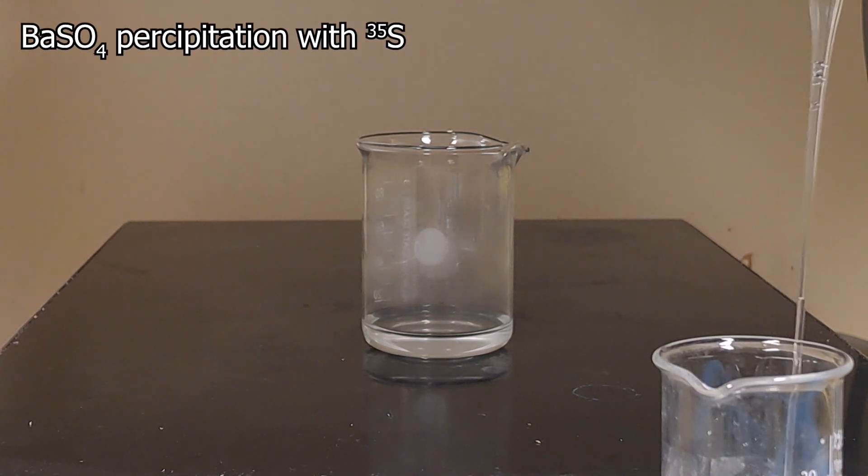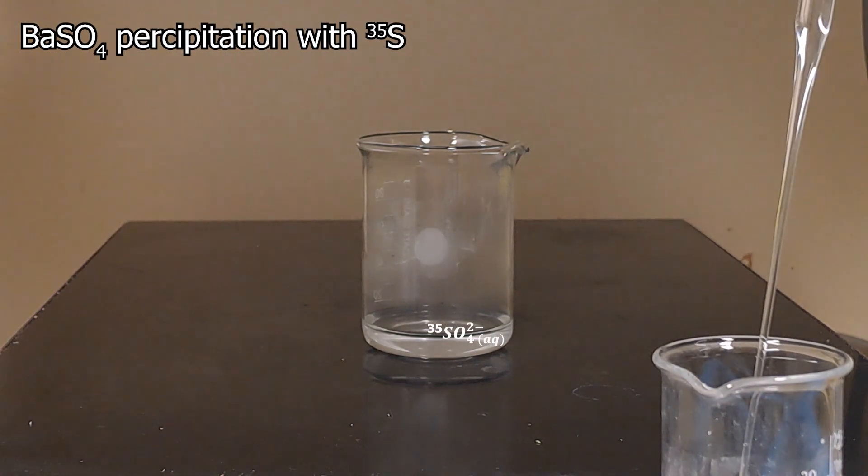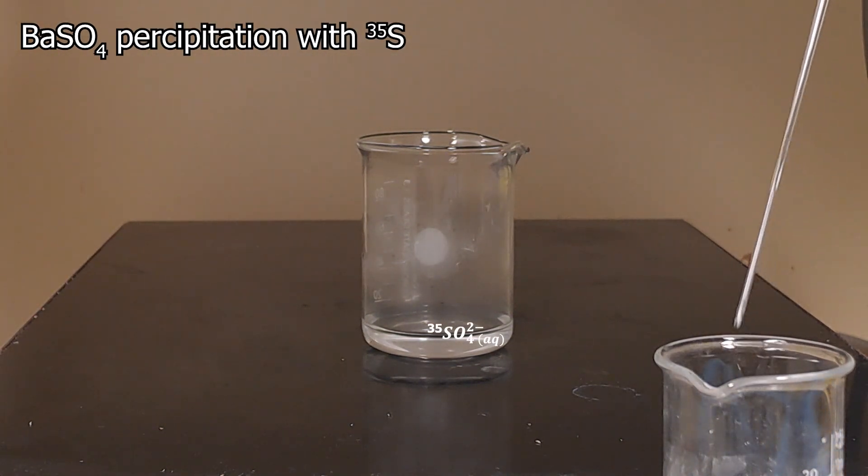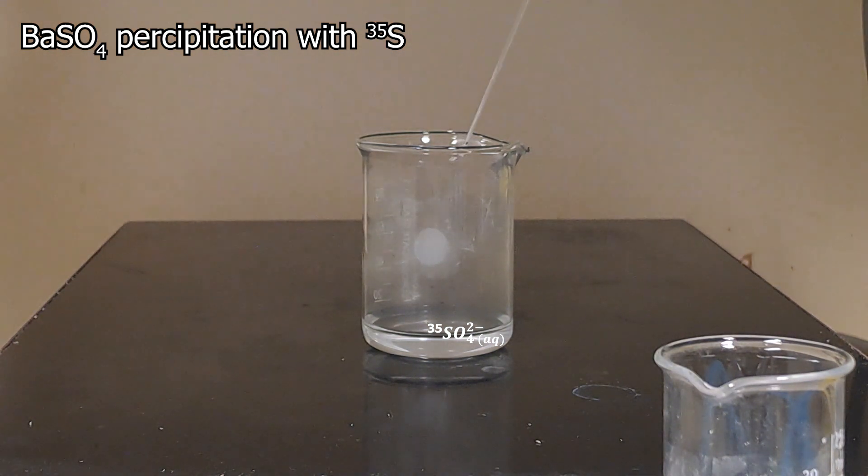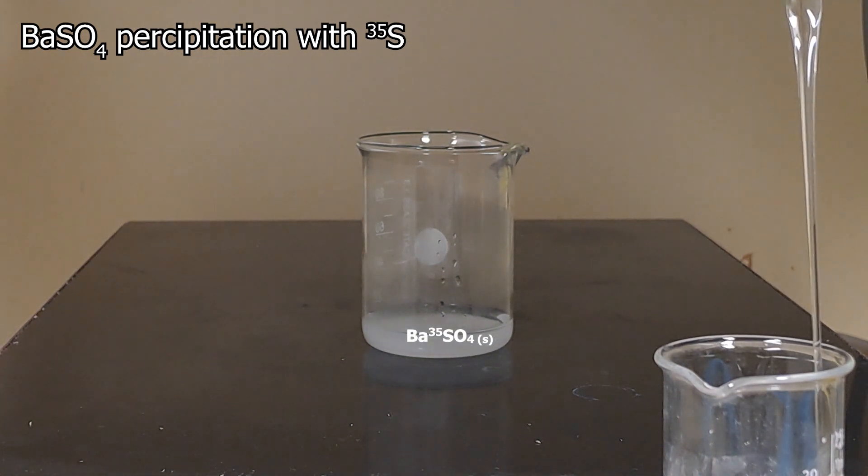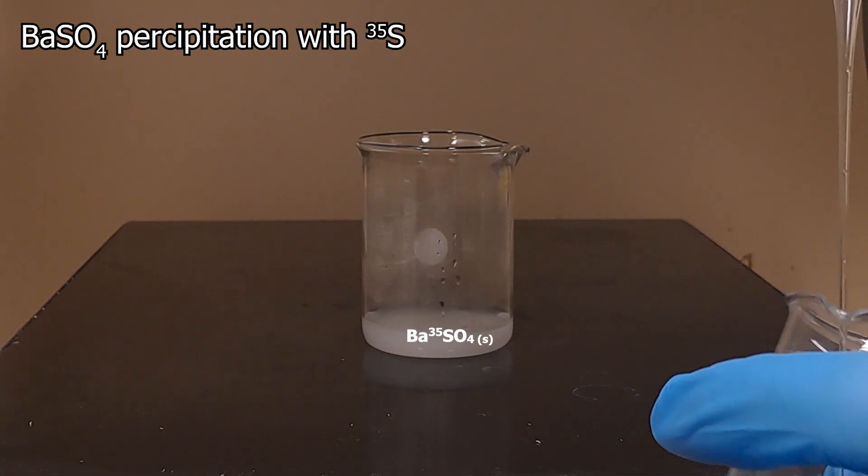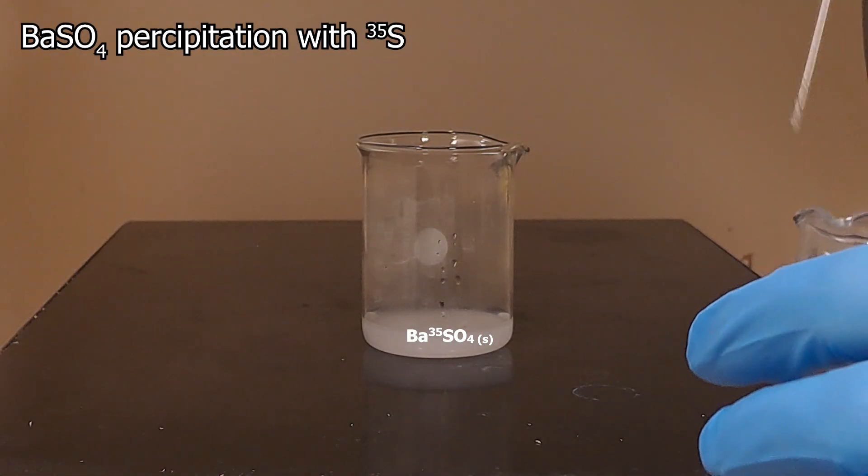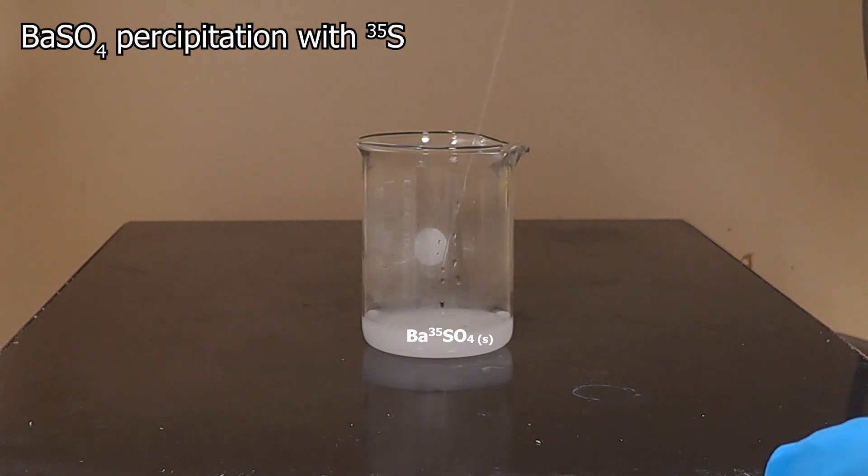Discussion of potential errors. So, why might your half-life calculations result in about three minutes or more? Some of this is due to the experimental procedure. For example, during precipitation, barium forms as a sulfate from the heat. We also do this on the Geiger-Müller day with sulfur-35, but in that case, this excuse doesn't apply here. There, we also precipitate barium sulfate, but the sulfur is radioactive, whereas in this experiment, the barium is radioactive.